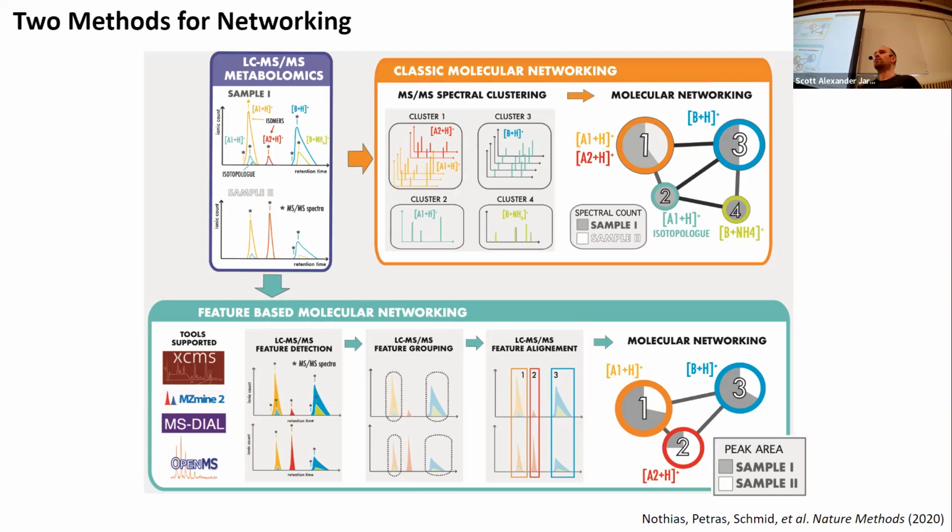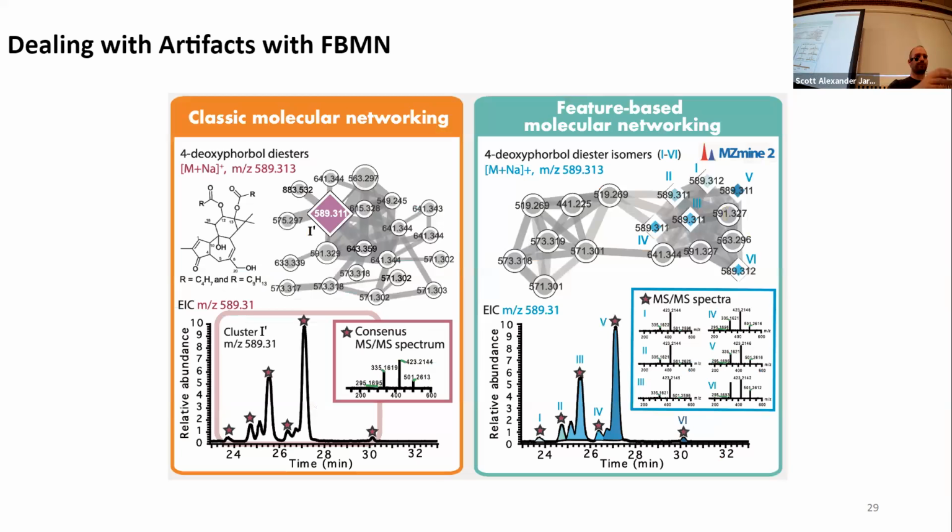I quickly run some classic molecular networks, because I'm not losing MS2 spectra by doing this pairing. I'm really considering all the data that is there. So I think there are good reasons to use both approaches. Obviously, for the workshop and this advanced data analysis we can perform with you, feature-based molecular networking is the way, but be aware that there's also this alternative.